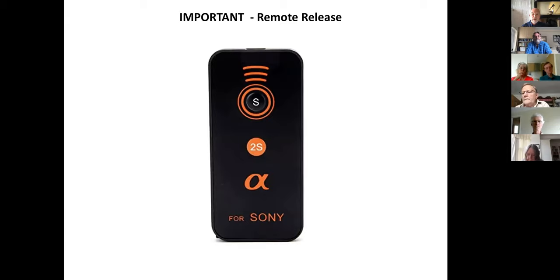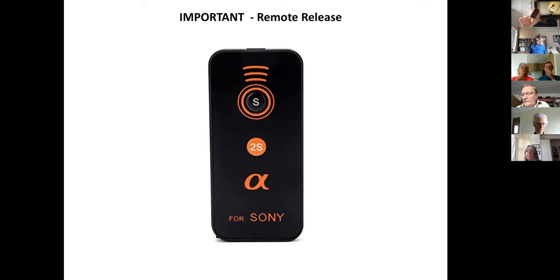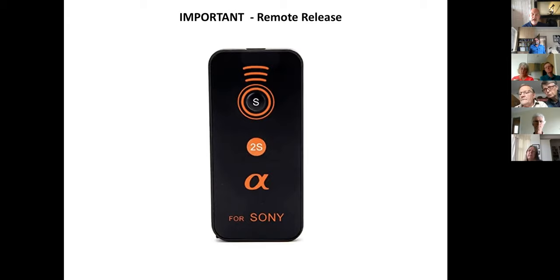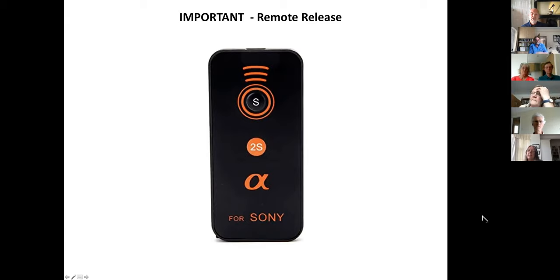There is a workaround — most cameras have a self-timer, and many have a two-second self-timer, so you can press the shutter and take your hands away. But a far better solution is a wireless remote controller. My little infrared remote cost a fiver on eBay. I adjust the focus, go completely hands-off, give it a second for any vibration to die down, then press the button on the remote to take my image. That reduces movement and vibration and helps a lot.